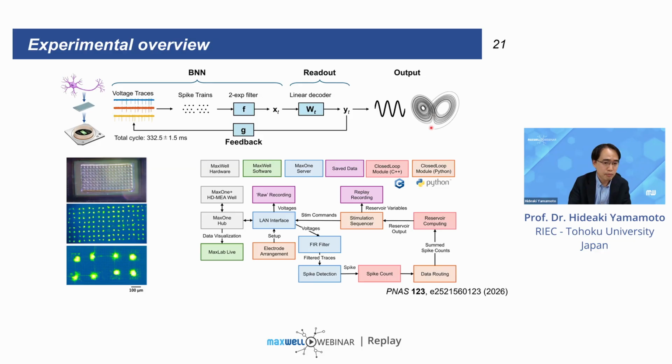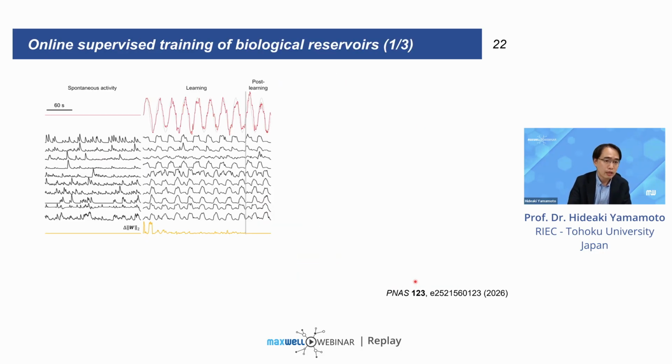And Maxwell offers a Python API and a C++ script to interface the recordings with the external computation. And we took advantage of this to set up this system. And this is a representative result of what we have achieved.